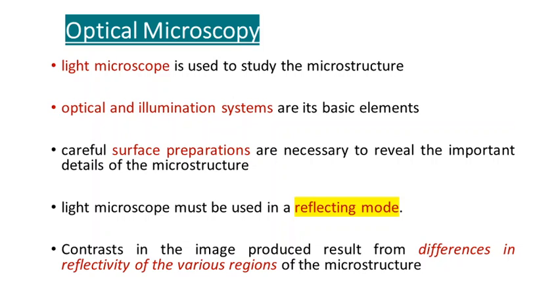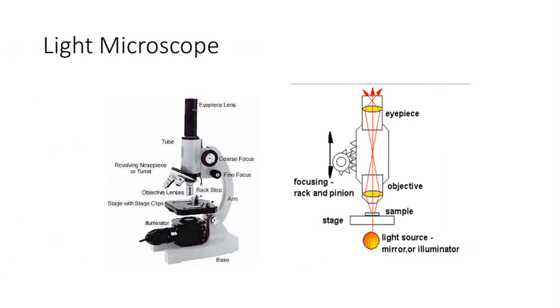This class of microscope is normally used for simple microscopic analysis with a magnification ranging up to 1000 to 2000 maximum. The maximum magnification with the optical microscope is 2000x. Common modes of operation are 100x, 200x, 400x, 1000x, etc. We have provision for varying the magnification, so we can achieve different magnifications.